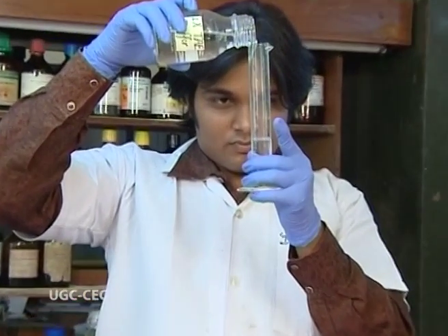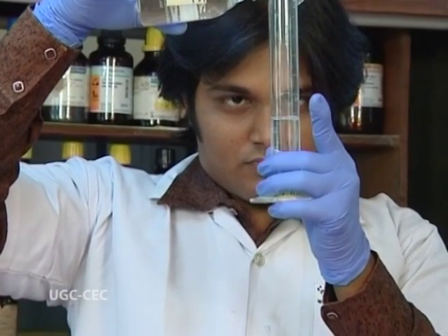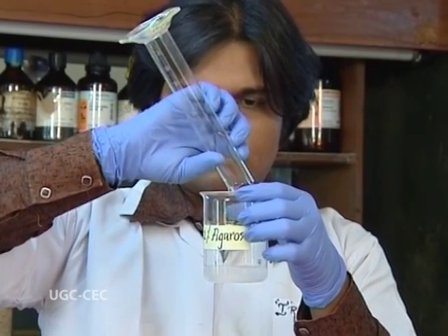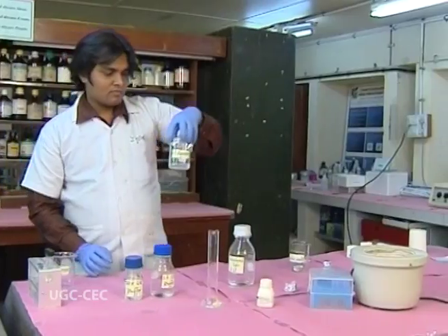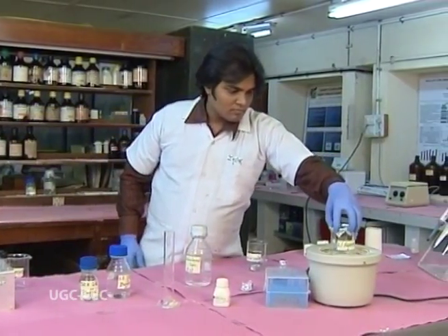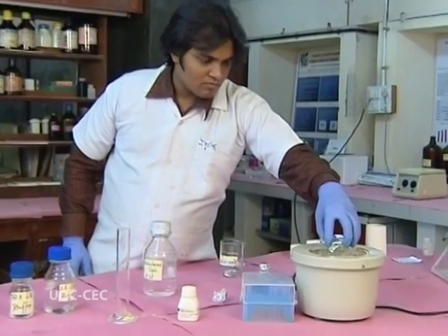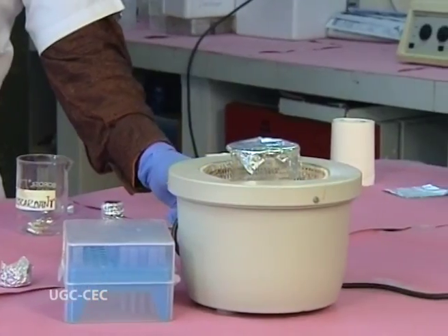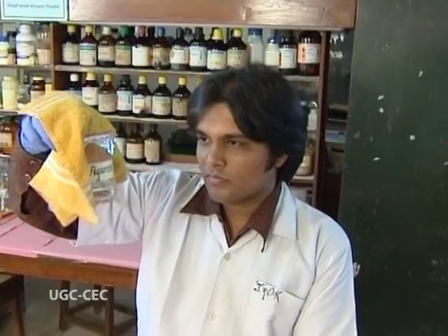What we do is we weigh the agarose, 1 gram, we put it into the beaker and then we pour 1x TAE into it. We make sure that the beaker is not shaking along, and then we put it into the heating mantle. Then we pass the current up to 70 degrees and we allow it to heat up till it turns transparent. When it turns transparent, it is ready for loading.